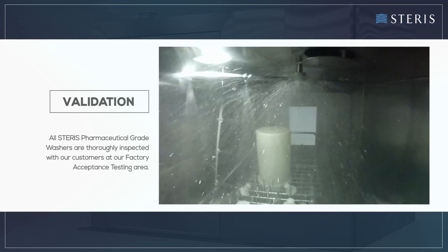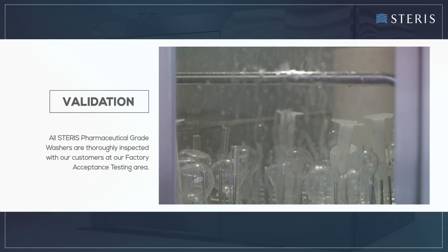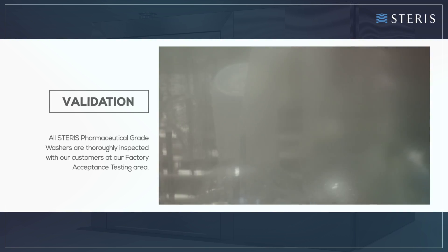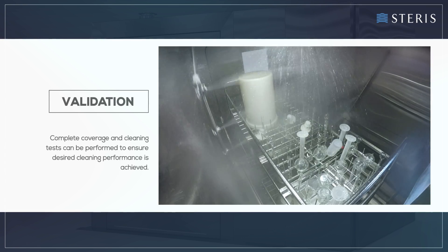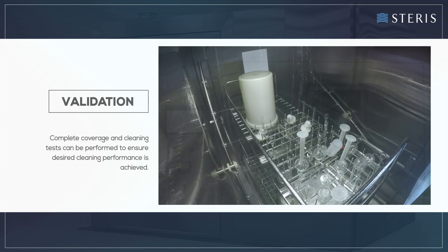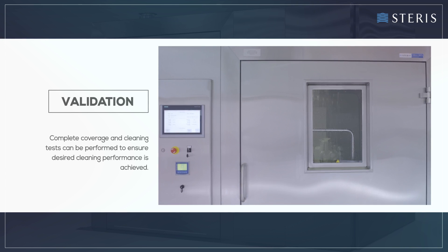All Steris pharmaceutical grade washers are thoroughly inspected with our customers at our factory acceptance testing area. Complete coverage and cleaning tests can be performed to ensure desired cleaning performance is achieved.